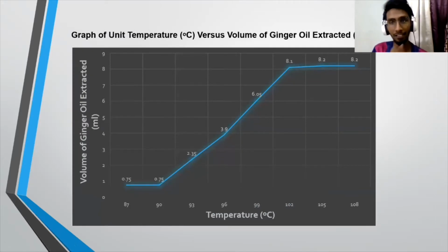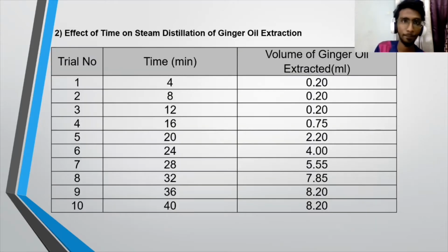And this is the graph that we drew from the obtained data, and it shows that it's increasing linearly until 8.1 milliliter, and then it starts to increase at a slower rate after that.